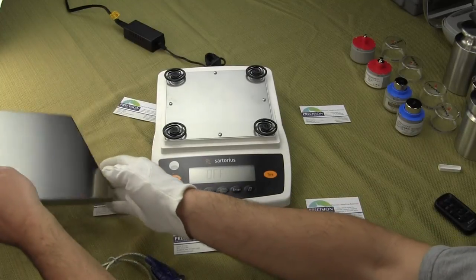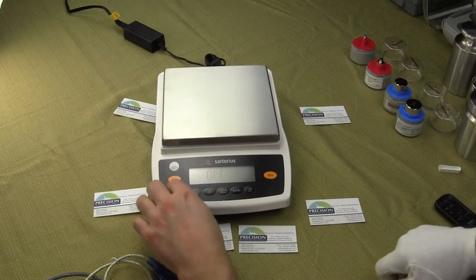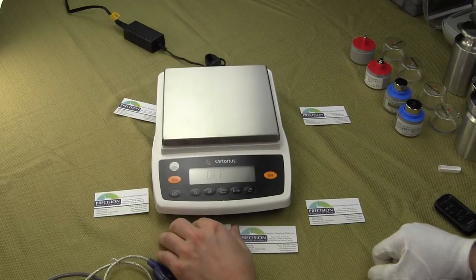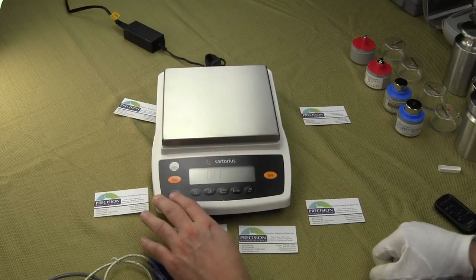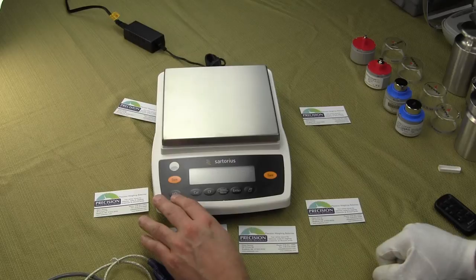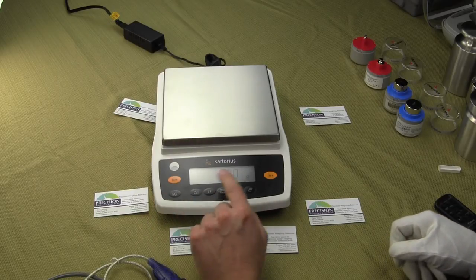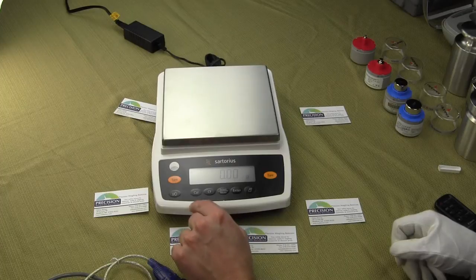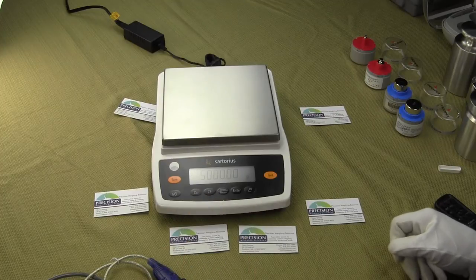Put back the platform and turn on the balance. To turn on the balance, all the way to the left here we have the on-off button. You'll notice when the balance powers up, it does the power-up sequence, and it goes exactly to the weigh mode.